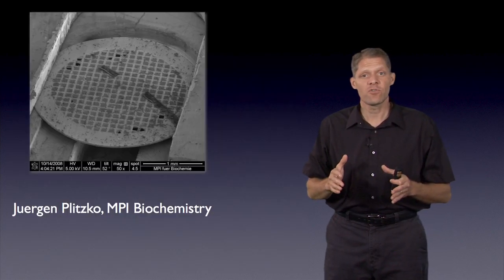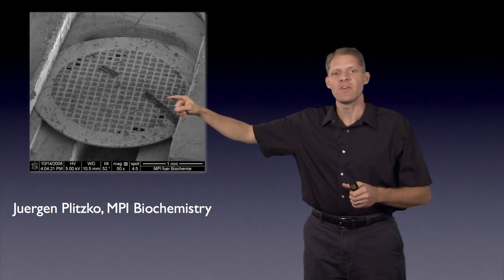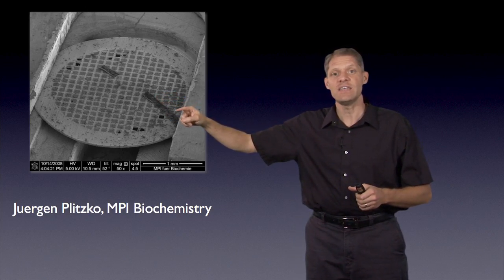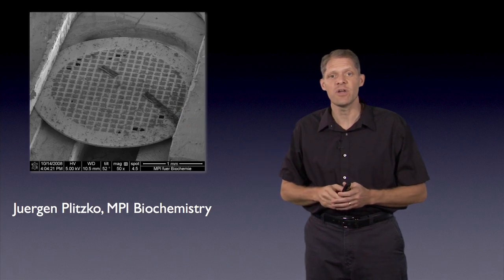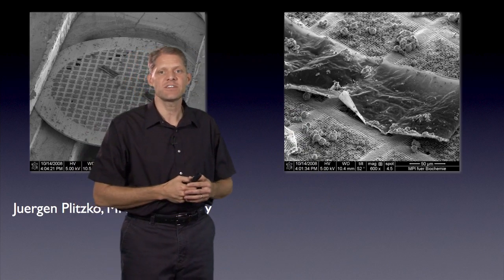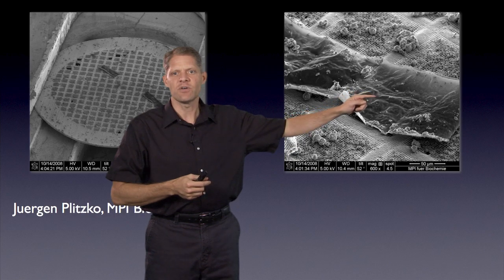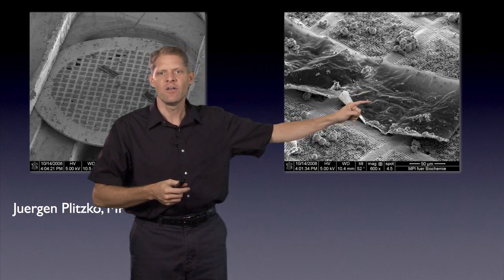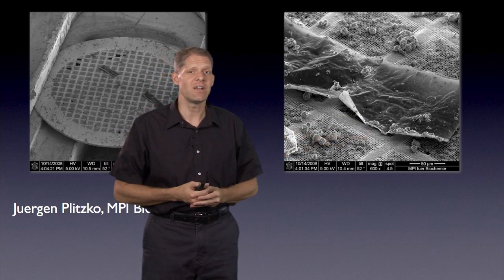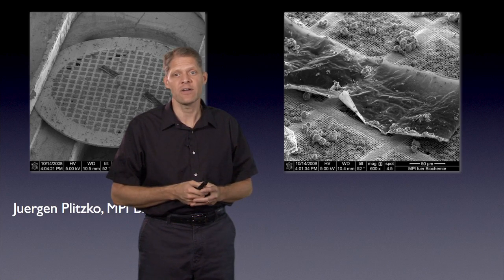When that ribbon of cryosections is laid across an EM grid, it can look like this. This is an SEM image of a ribbon of cryosections laid down across an electron microscope grid. Now, one of the challenges of this technique is that the cryosections themselves are often crumpled and crinkled. Here we see in the SEM image of the cryosection lying on the grid that the section isn't even nearly flat. And there's also a lot of contamination on this particular cryosection.